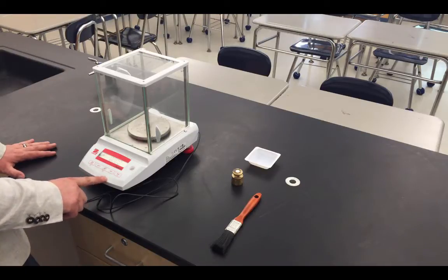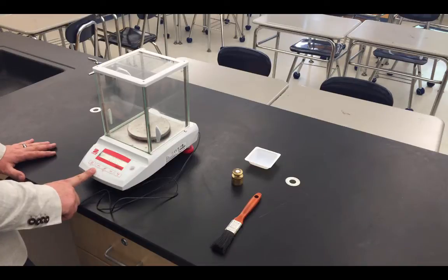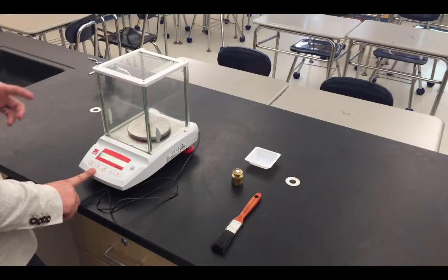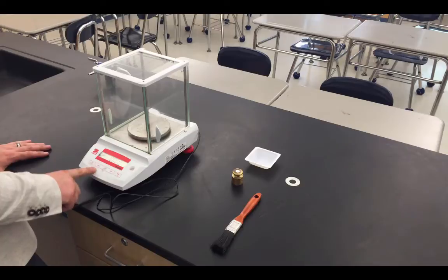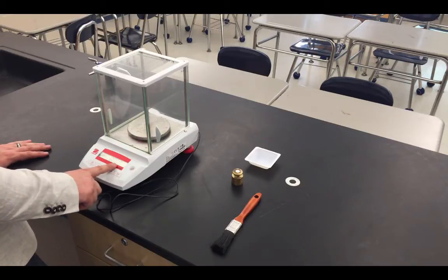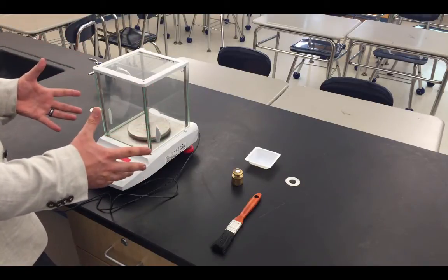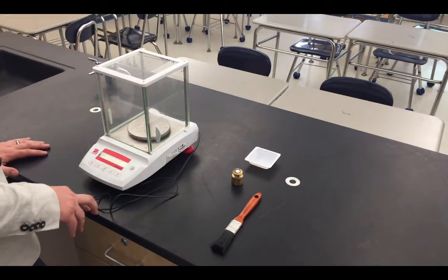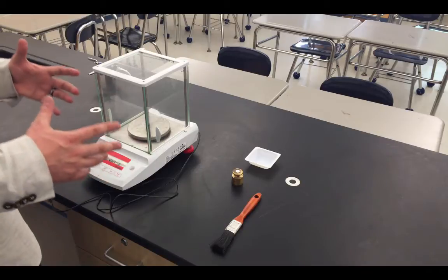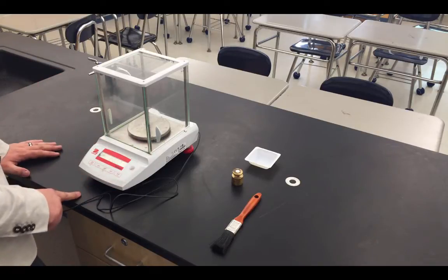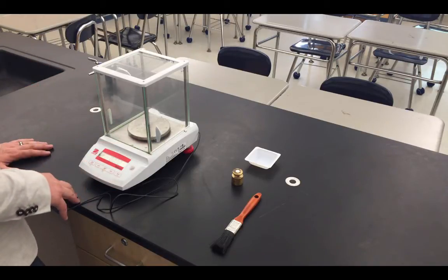One of the things we can definitely do with the balance here is you'll notice the button in the center has this 0 slash T marking. This is a button for either zeroing the balance or tearing the balance. If at any point in time the balance does not read 0, you can press this button and the balance will recalibrate itself so that whatever is on the balance pan reads out as zero grams. It's a good practice, no matter what, when you start using a balance, to always hit the tear button to ensure your balance is properly zeroed out.